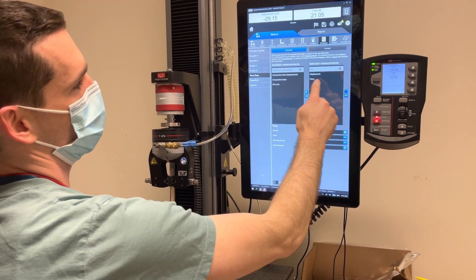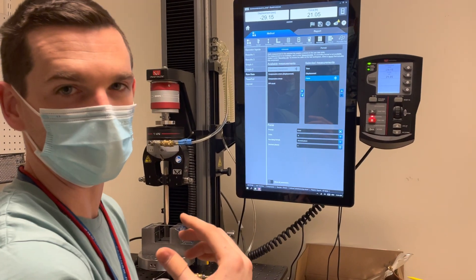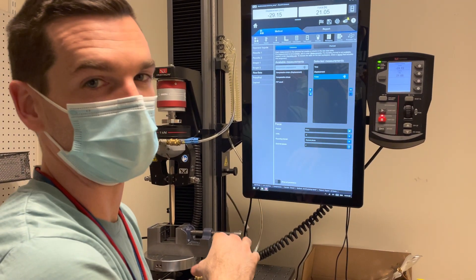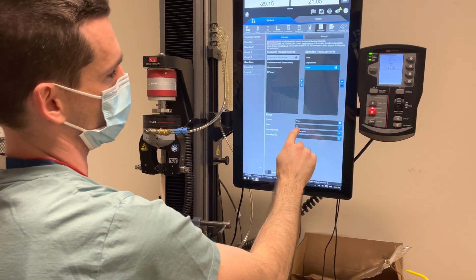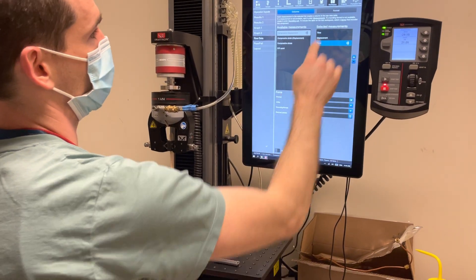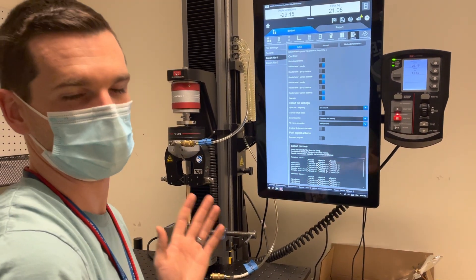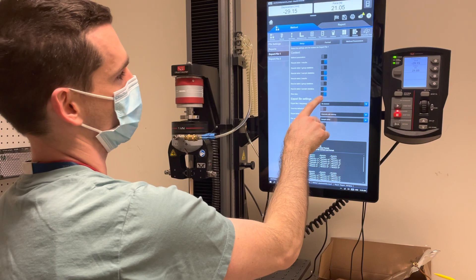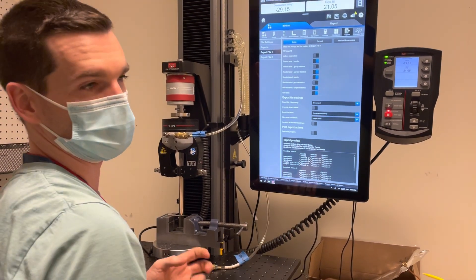In raw data, this is actually the most important thing. When I get my raw data out and I'm plotting it, I don't want kilonewtons, because if I measured very small forces, it may appear as a bunch of zeros and you'd have to reopen the data to view it. Make sure your raw data force is set to newtons — you can even go to millinewtons if forces are very small. In your exports, under export file one, you can turn raw data on if you want to plot x versus y or calculate stress and strain on your own. Ensure raw data is checked, and set it to create one file rather than a file per specimen.